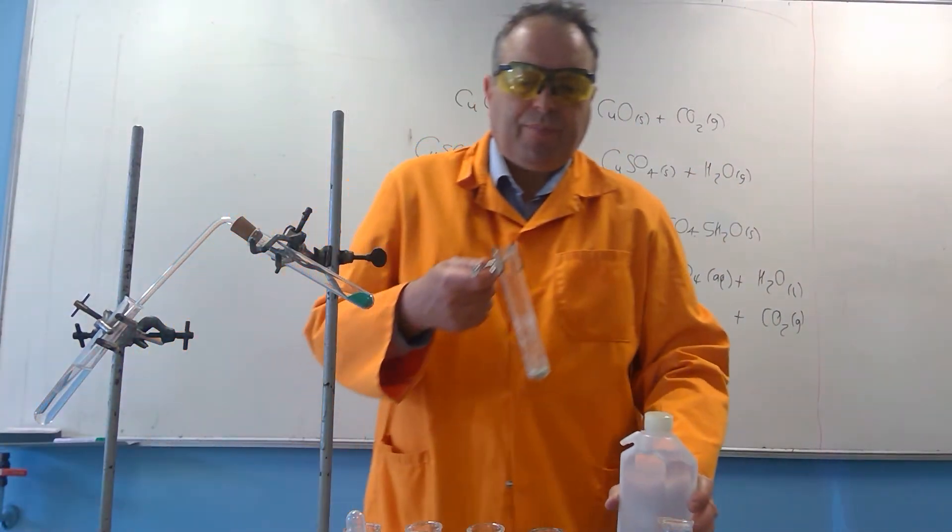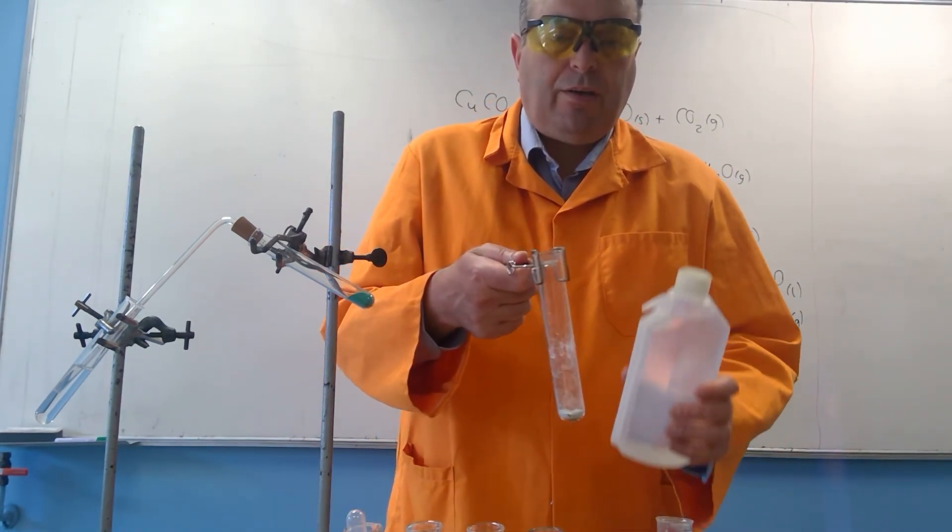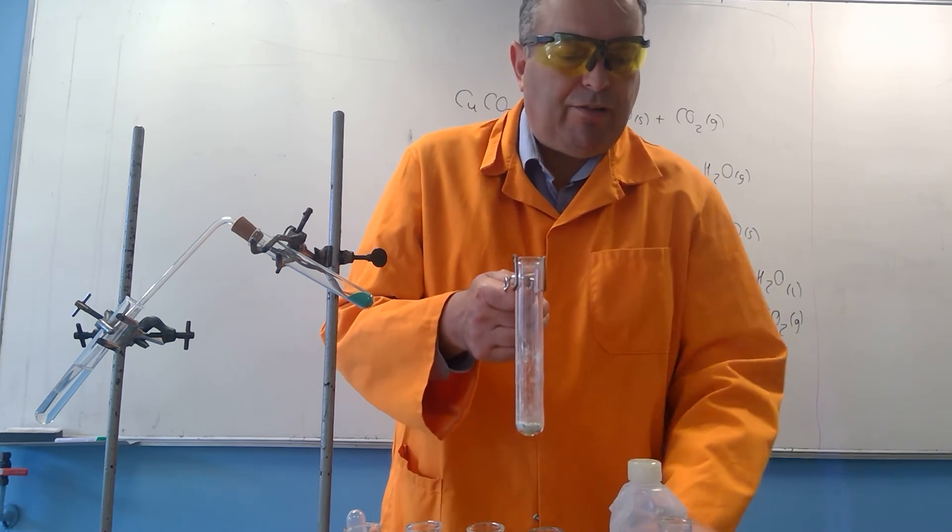Found the water bottle. So I've got white anhydrous copper sulfate, and then if you look, I'll try and get a little bit nearer to the camera.